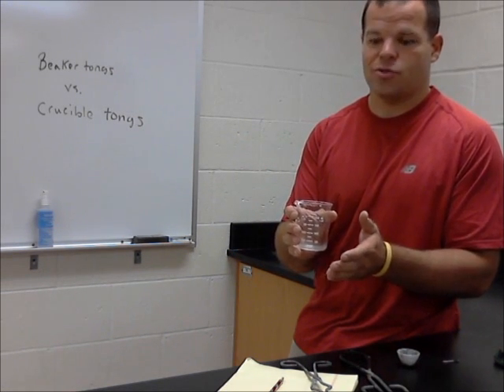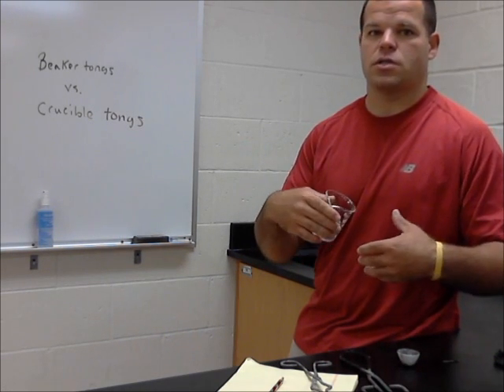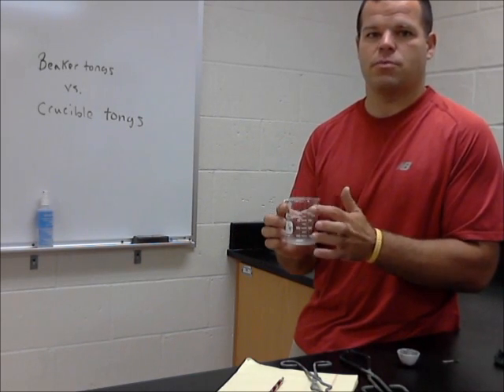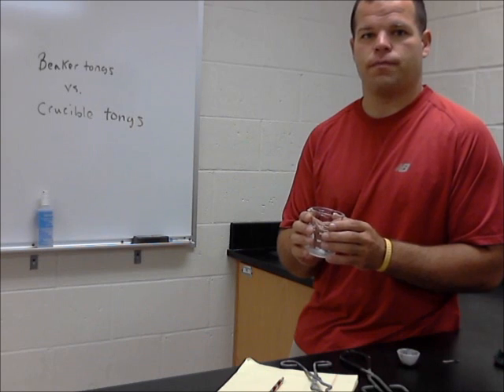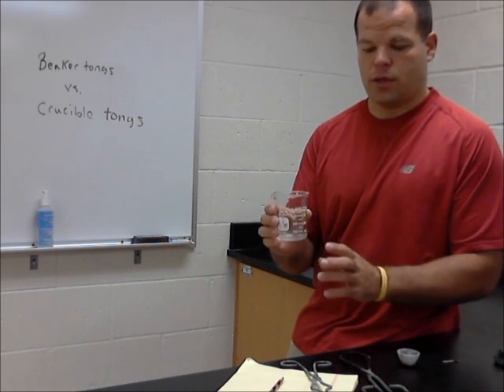Quite often we'd say these are drawn by monkeys, meaning they're not very accurate. So if you need a certain amount of water just to boil or do something very vague with, then you'd use these markings. Otherwise, buyer beware. Okay. But if you're using it and there's some liquid in there, how would you transport this thing?